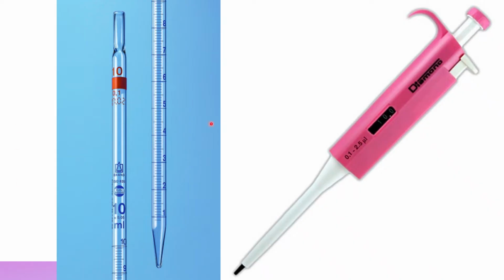This photo on the left side, class, is what we call the Mohr pipette, or also known as the graduated pipette. And this is the type of pipette used to measure the volume of the liquid dispensed, although not as accurately as a volumetric pipette. The one on the right is what we call the automated micropipettes. So these are micropipetting devices because they can dispense 0.1 to 2.5 microliters. These are the new and advanced semi-automated pipettes that we have in the laboratory.